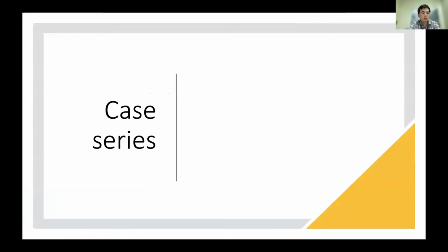So this Barr body is just to illustrate to you who would have known that by careful observation of the morphology actually also can tell you so much story on sex chromosome.